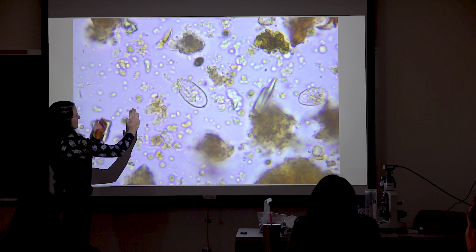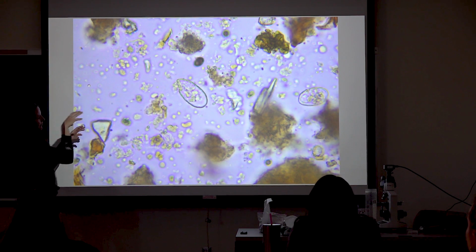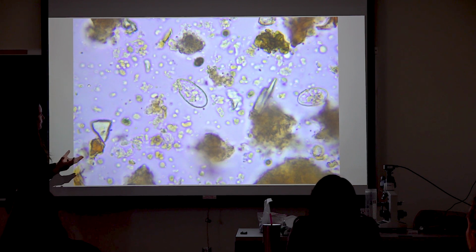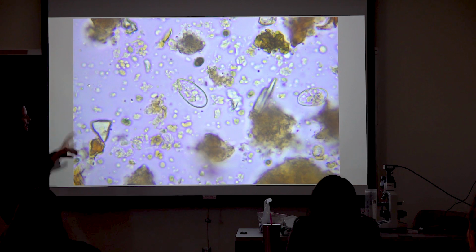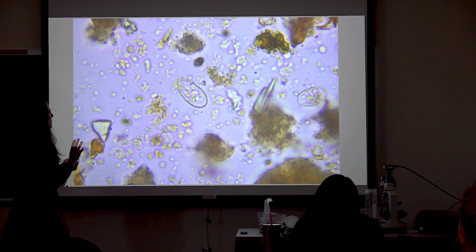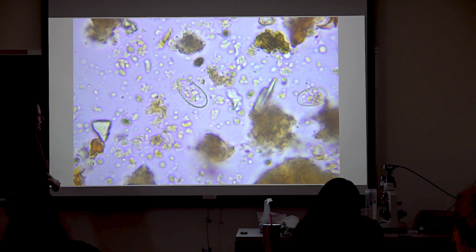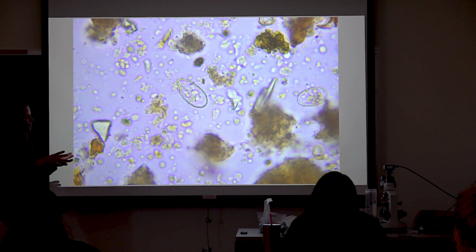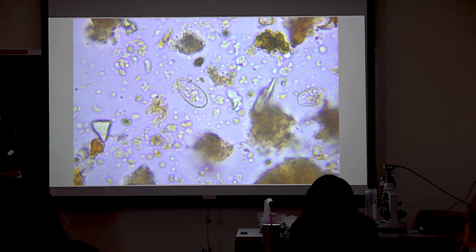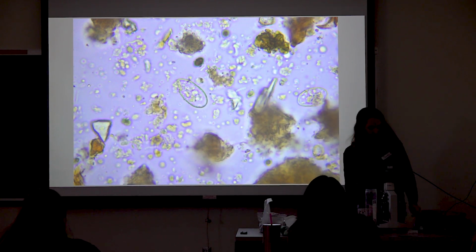So this one is turned sideways where you're seeing that little cutout, and the other one is flipped on its back where you can see the opening kind of through the shell and on the other side. And if we ever let this sit long enough, you would start to see the amoeba kind of poking out. I've got some really cool videos on my laptop that I can show you later if you want. Often, though, you won't see them coming out of their shells unless you let this slide sit around for a while. There are ways to create these little humidors for your slides because the only problem with letting a slide sit out for too long is it'll dry out, and then it's going to totally change this. That amoeba might just go completely dormant, and then you'll never see it moving around.